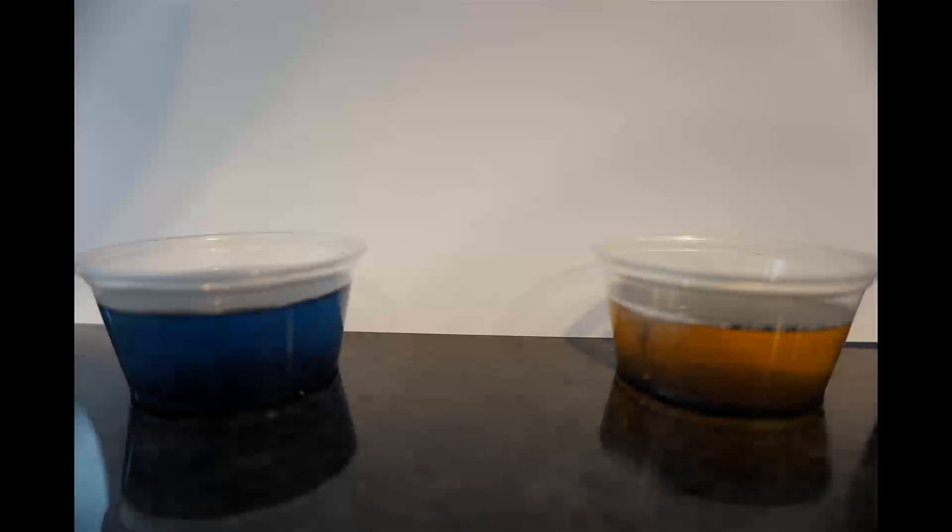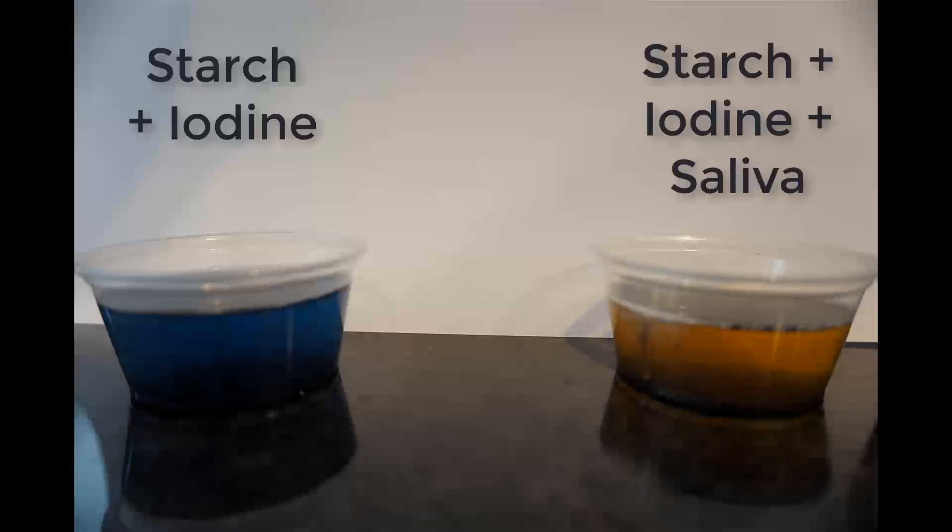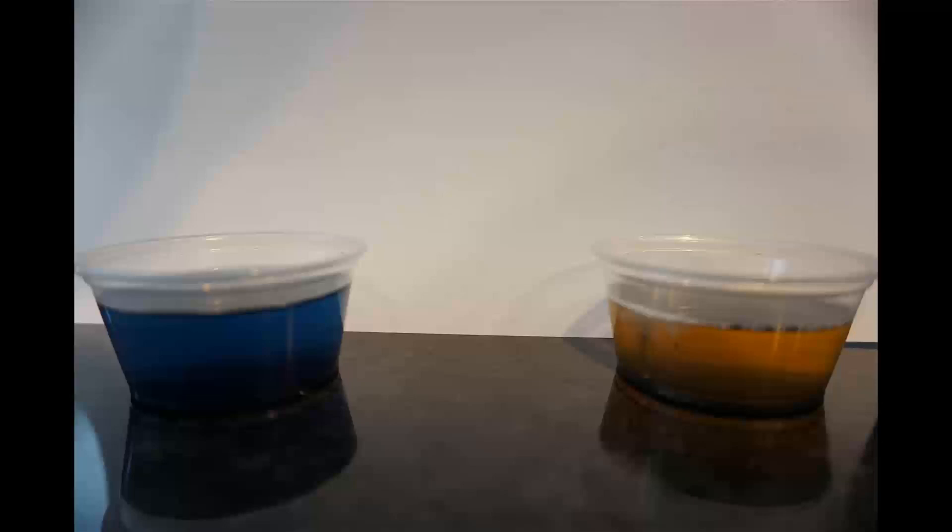After an hour, here's what we have. On the left is the starch and iodine, and on the right is the one with saliva in it. You can see that the iodine reacts as it normally does with the starch on the left-hand side.